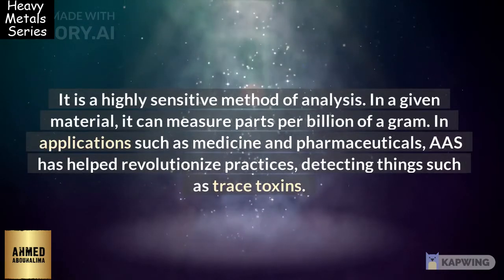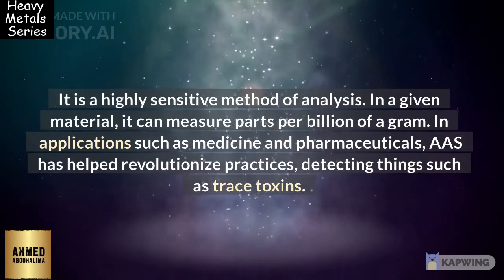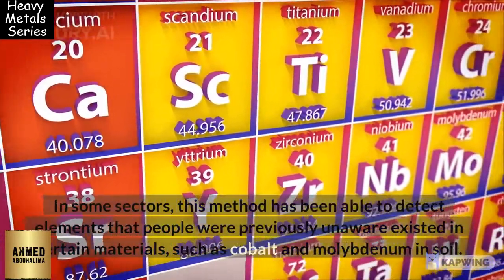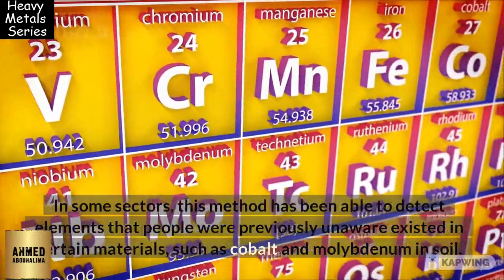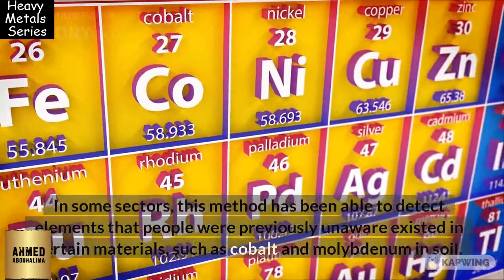In applications such as medicine and pharmaceuticals, AAS has helped revolutionize practices, detecting things such as trace toxins. In some sectors, this method has been able to detect elements that people were previously unaware existed in certain materials, such as cobalt and molybdenum in soil.